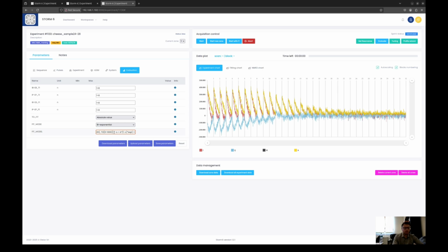With multi-exponential components, this is mostly the case, that the formula which we use needs a kind of tuning to get the proper components. Because each component has different weightage, different T1, different relaxation times, it's not always possible that the default formula will give you the correct results.